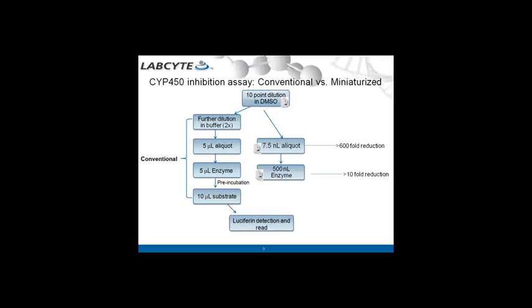This mixture is incubated for appropriate amount of time. Then 500 nanoliter substrate is added to enzyme and inhibitor. Here you have 10-fold reduction in substrate again.